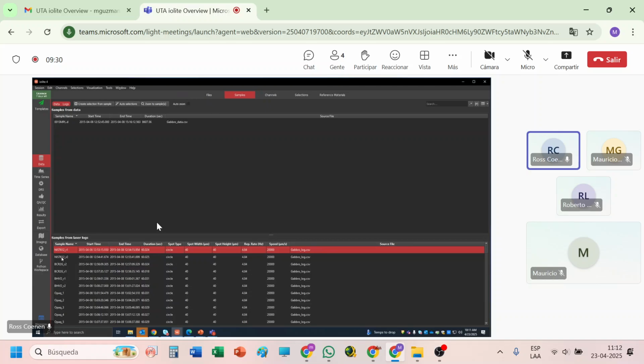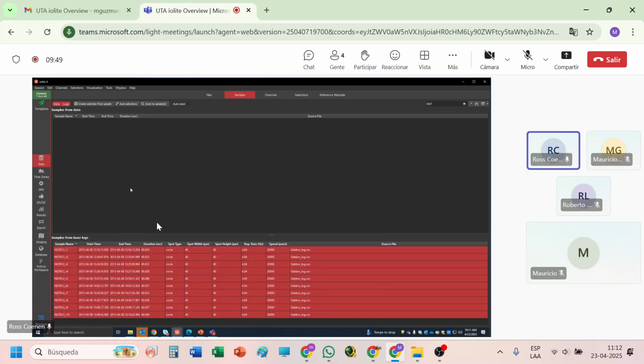And so we'll go through and see NIST 612 here. I'm actually going to search up here so I can pull up just the NIST 612, which I'm doing in the top right here. So now you see, down here, it's just all the NIST 612. I'm going to select all of these. And now we're going to give it that name. So create selection.